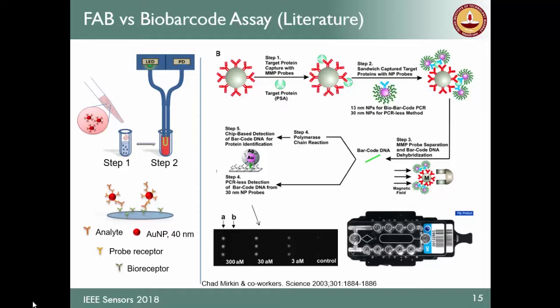You could avoid this by simply using a good combination of label and probe.